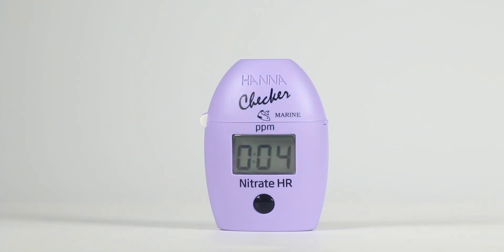When the timer ends, the checker will perform the reading. The instrument displays the nitrate concentration in ppm. The checker automatically turns off ten minutes after the reading.